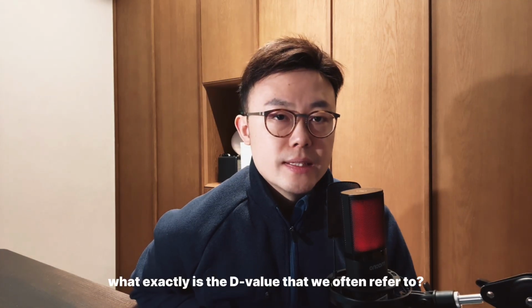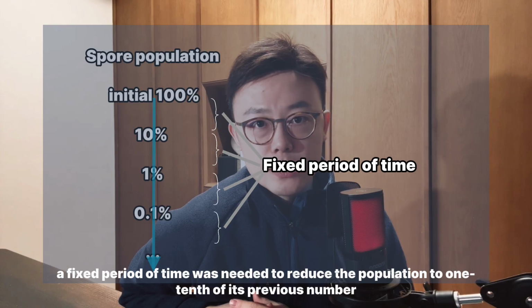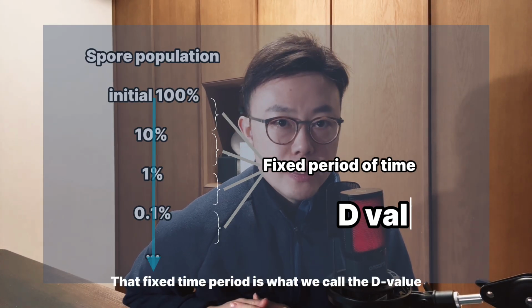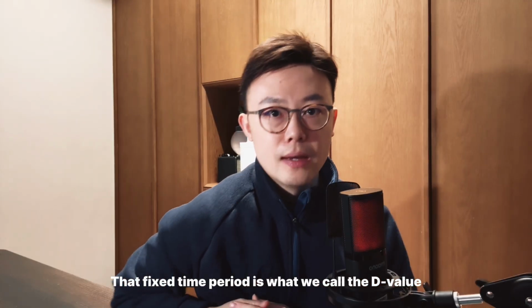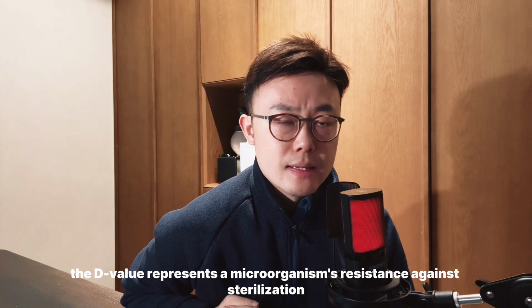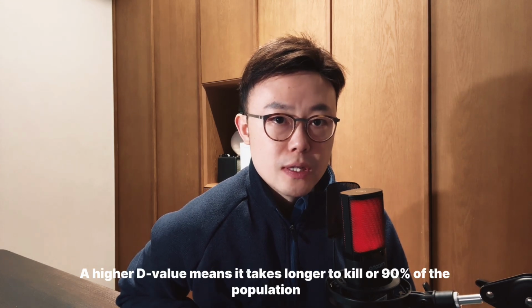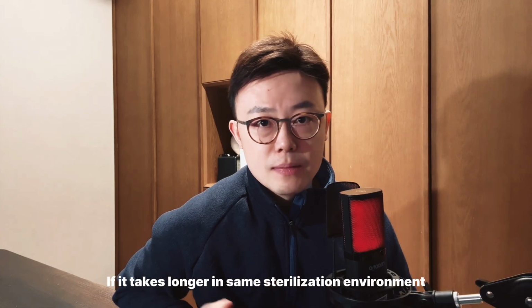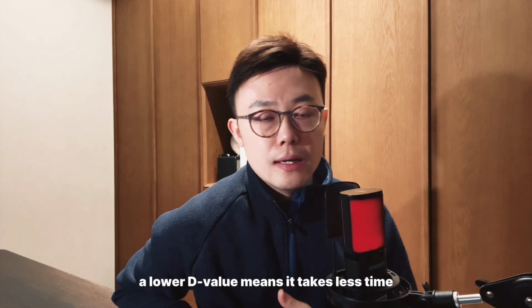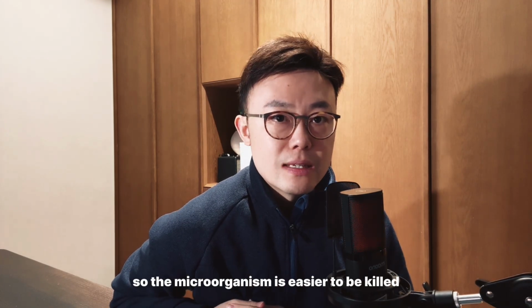So what exactly is the d-value that we often refer to? A fixed period of time was needed to reduce the population to 1/10 of its previous number. That fixed time period is what we call the d-value. In general, the d-value represents a microorganism's resistance against sterilization. A higher d-value means it takes longer to kill 90% of the population. If it takes longer in the same sterilization environment, it is harder to kill. Conversely, a lower d-value means it takes less time, so the microorganism is easier to kill.